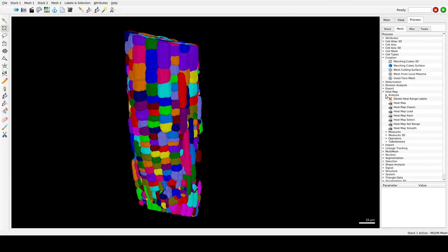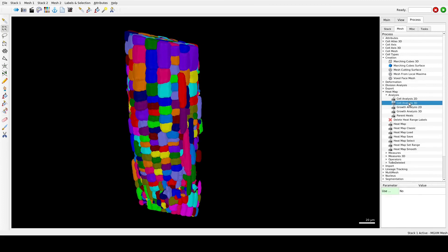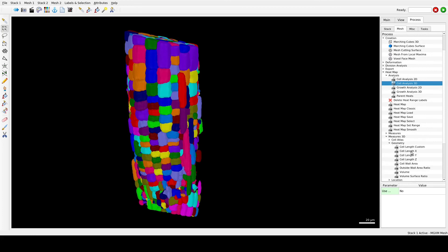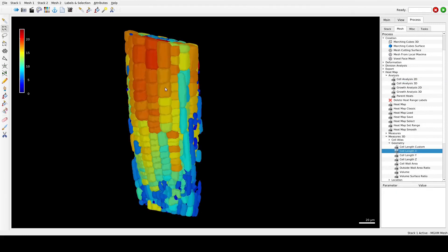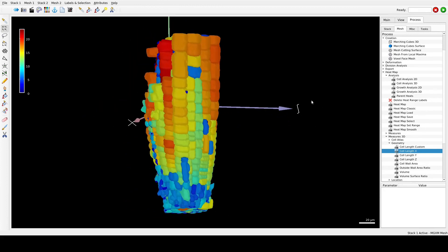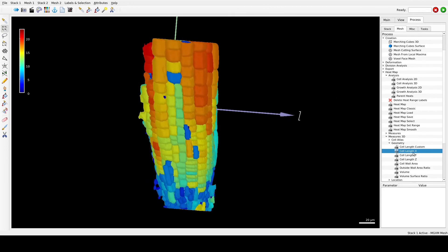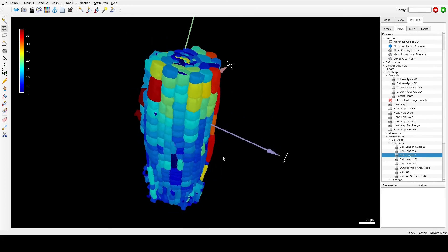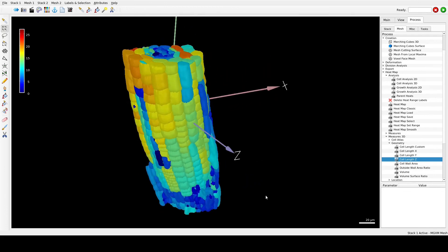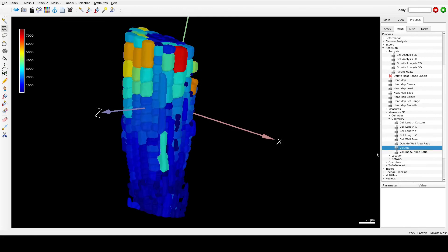If you want to create heatmaps, go to Heatmap Analysis > Cell Analysis 3D — this will allow you to generate heatmaps. After that, go to Measures 3D, then Geometry, and run something like measure the cell size in the X dimension of a 3D cell. You can see the cells that are biggest on the X axis shown in red, or the ones that are more elongated are in red, or the ones that are thicker in Z. You can also measure the volume of the cells.